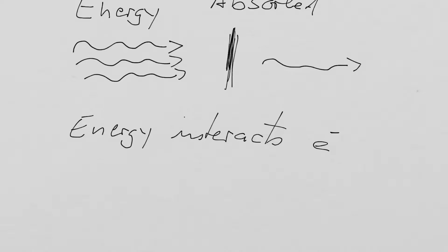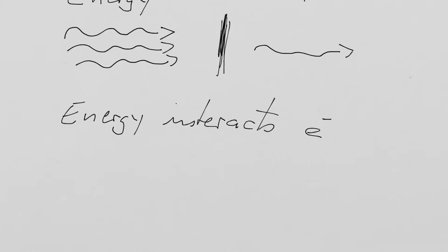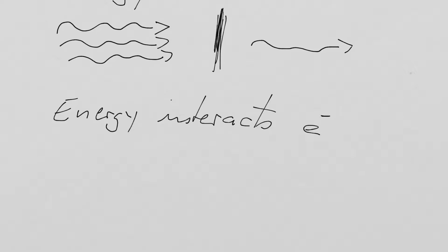You had a compound in the practical, paranitrophenol, and this compound is characterized by a number of electrons that are in a state that is easily pushable, easily excitable. So we can use light that doesn't have too much energy. It has exactly the right amount of energy to bring the electrons to the next level.